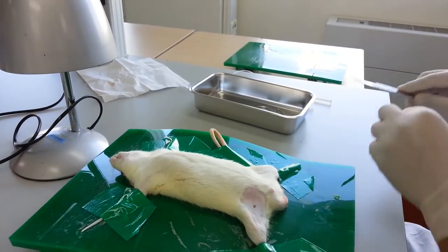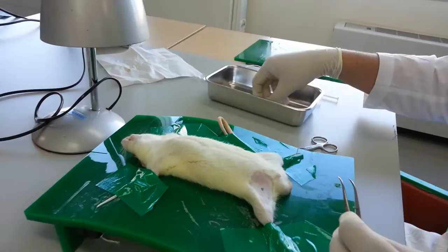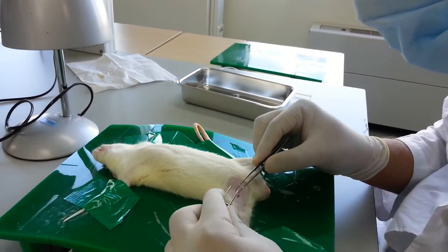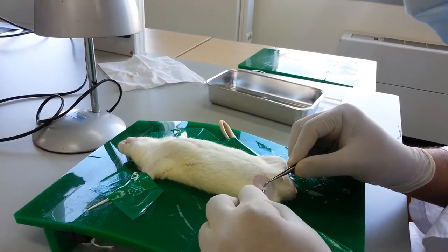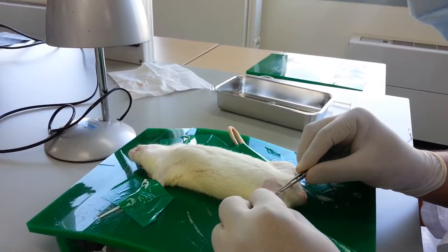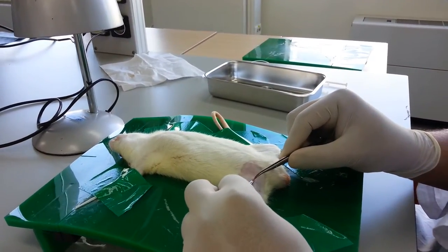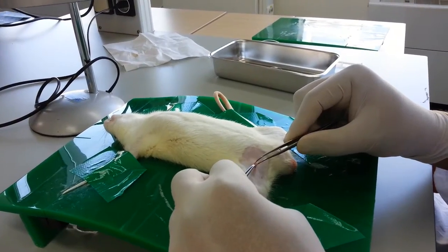What you need to do is to just calmly and slowly make it a little wider so that we may be able to see the vein and the artery. Here we can see it.